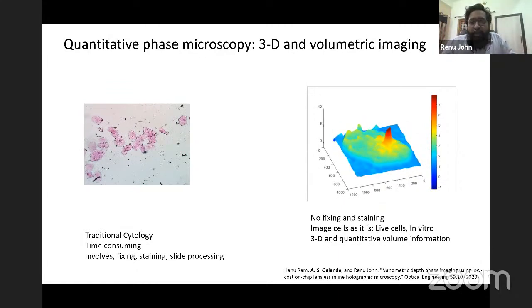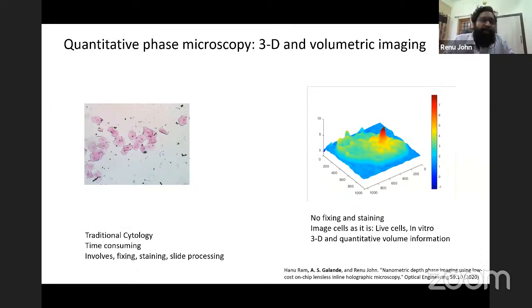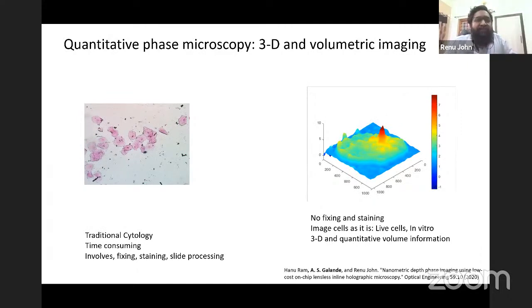And how it is important is that typically in the case of a cancer cell or a precancerous cell, there is a lot of nuclear activity or the division of the nucleus. So those type of cells which are precancerous in nature will have a lot of nuclear content, because the cytoplasm is dividing and the nucleus starts dividing first. Those type of cells are either having a high nuclear content, or they might be multinucleate, or even having a lot of nuclear content which gets them into dividing.